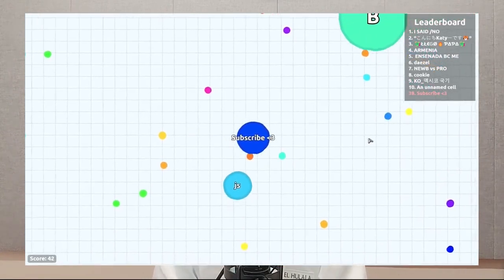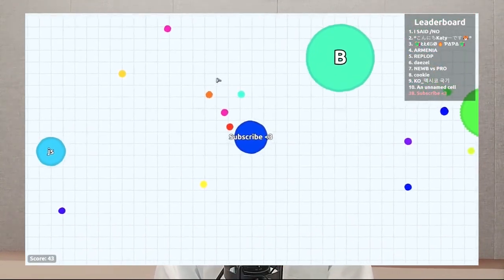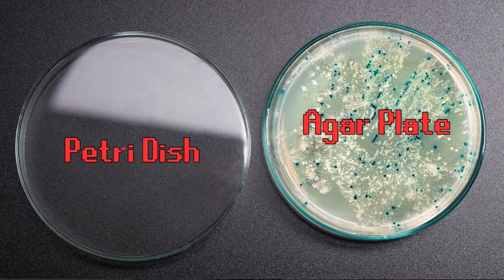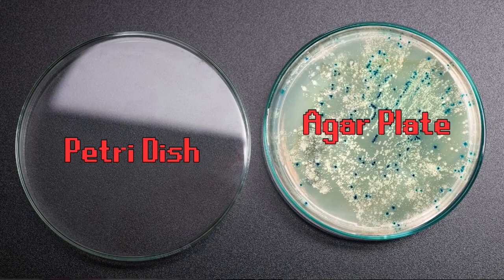We're also going to prep something called an agar plate. If you've played the game Agario, then you've probably been introduced to this concept before. An agar plate is basically just a material called agar, and bacteria grows on it. In the game, you're a bacterium eating other things on an agar plate. Also, don't mix this up with a petri dish. A petri dish is just a dish, the actual plate. You put agar in the petri dish to make an agar plate.